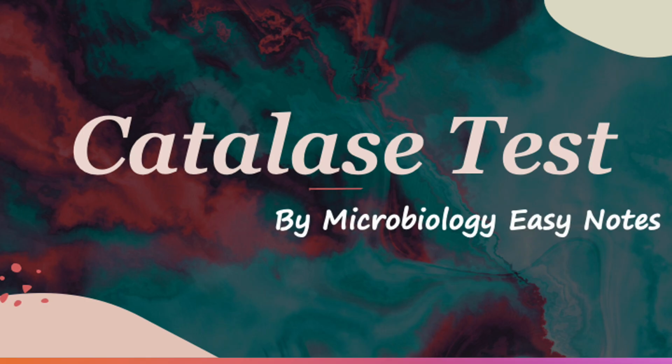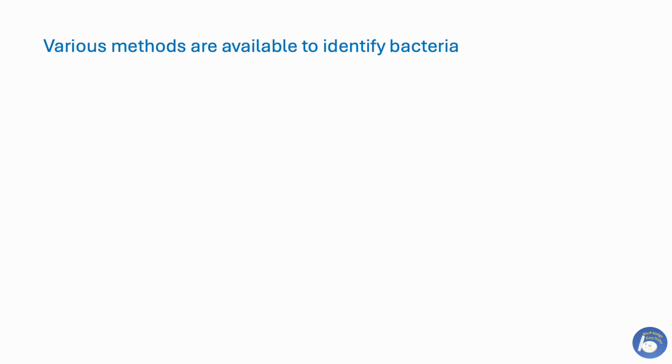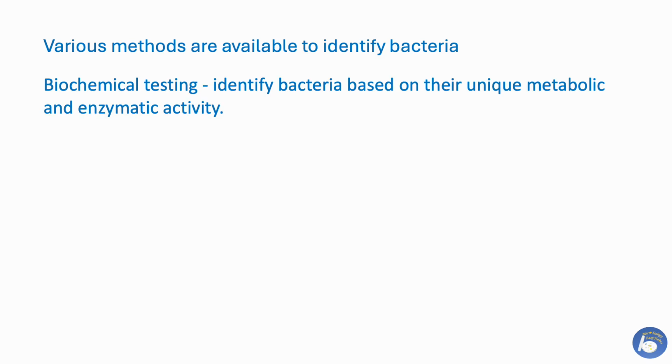Today's topic, Catalase Test. There are various ways by which microbes are identified in the microbiology lab. Biochemical testing is one of the methods to identify bacteria based on their unique metabolic and enzymatic activities. Among numerous biochemical tests, one of the tests is Catalase Test.